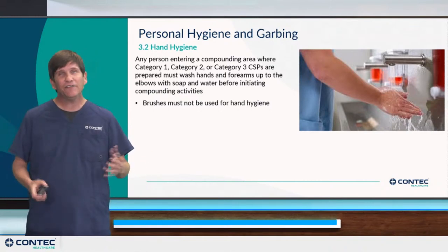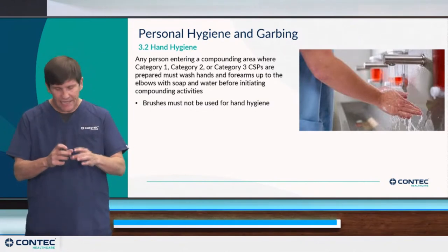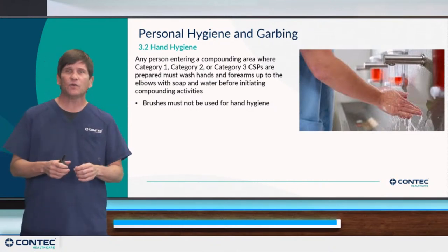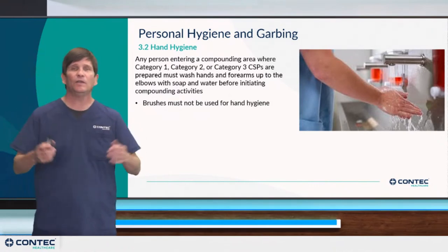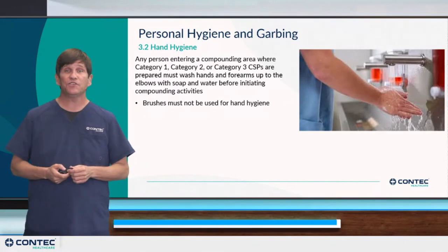And they're talking about here, if you think of folks that might be going into an operating room, they'll have these individually packed sponges, and each sponge may be impregnated with iodine or a hand cleaning chemical. They'll have a nail pick sort of embedded right there. Those sponges have almost like a sandpaper, a Scotch-Brite side, and that can exfoliate your skin, shedding lots of particles and fibers. So the chapter specifically forbids those brushes from being used.